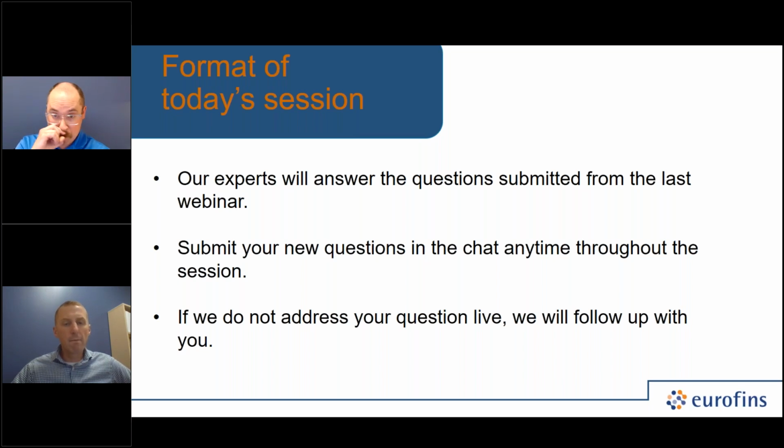Okay, moving on to the next one, which is, are there complications when testing by flow cytometry when there are live cells, in this particular question specifically Bacillus cells, and also dead postbiotics present? So are there issues with enumerating postbiotic in the presence of a live cell or vice versa? Sure. There is potential for interference to occur when looking at a blended material containing a live spore and a postbiotic.